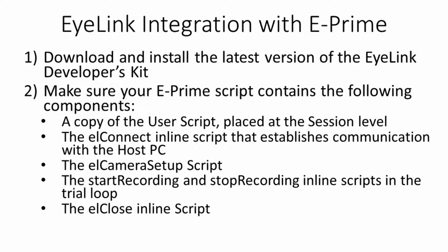The ELConnect inline script that establishes the communication between your display PC and the host PC and allows you to configure various host PC parameters. The ELCamera setup script, which allows you to set up the participant and perform calibration and validation. The trial loop should start with the start recording script and end with the stop recording inline script.